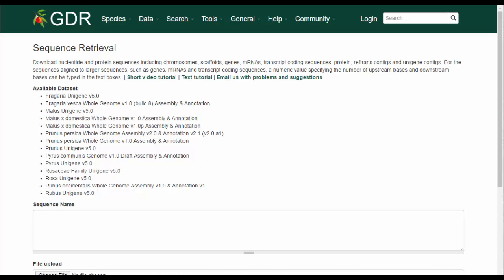Users can also download sequences from genomes where genes, mRNAs, and transcript coding sequences are aligned. Please note that this tool is designed for downloading a limited number of sequences at one time. If you would like to download all the contigs or scaffolds from a dataset, please use the FTP site or search sequences.